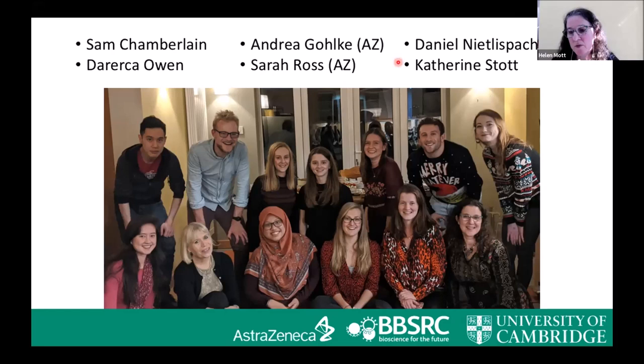I myself was also wondering how you can imagine that you have only one RAL per site being bound, because of the edges. I think there wouldn't be enough space. Obviously we were considering using other, bigger ones. There's a lot of work in the RAS field about clustering, and they think RAS is forming dimers. So whether we could try conditions where we could get two per face, but then we might just end up with no signal anymore.